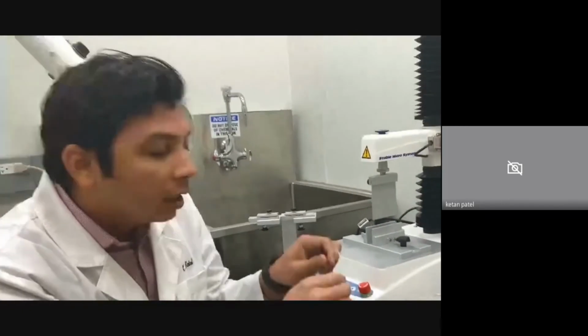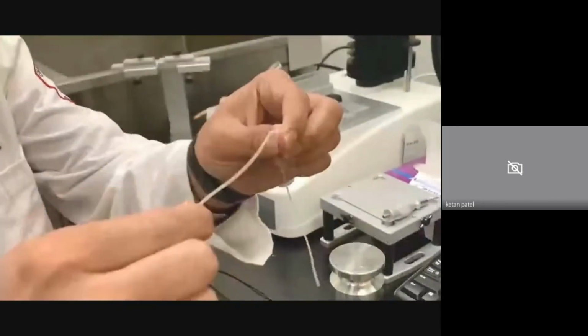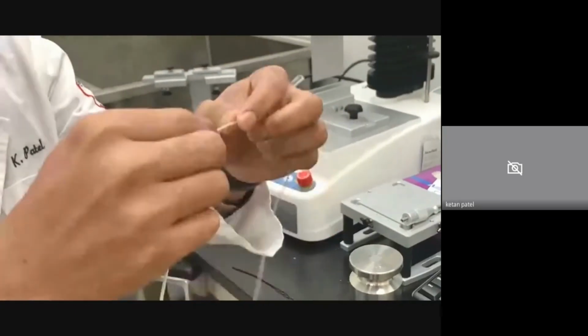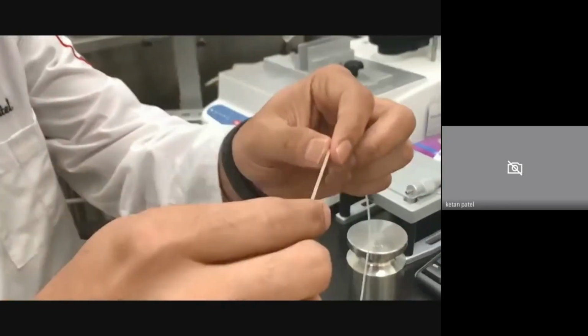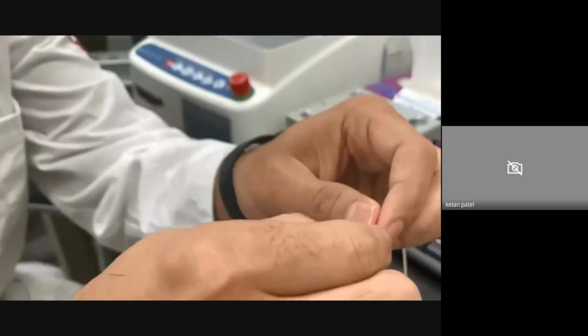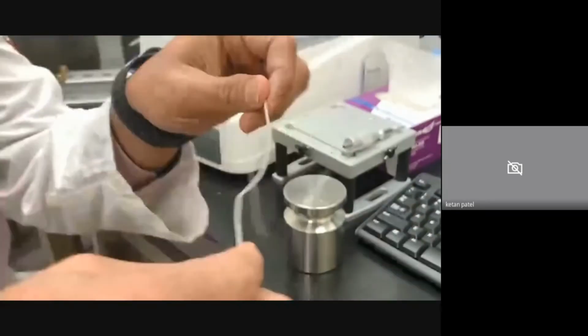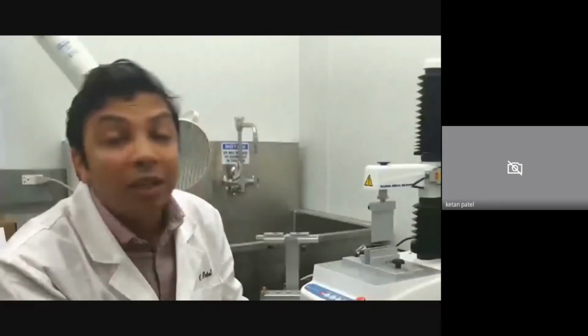On the other hand, this is like a shoelace. That's too rubbery. With this kind of filament, and I'm not sure you can see it clearly, the drug or a plasticizer has been precipitated out of the filament. The surface is so rough, and this is very flexible. This kind of filament as well is not easily printable.